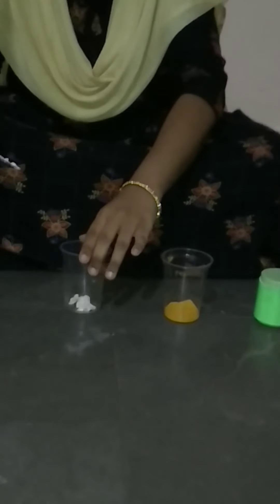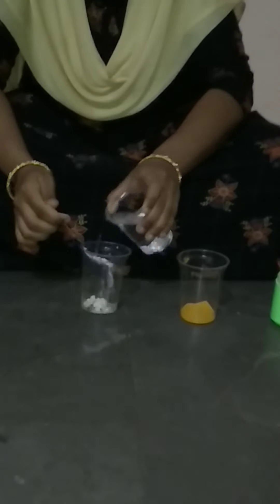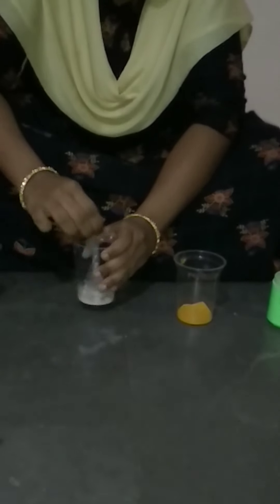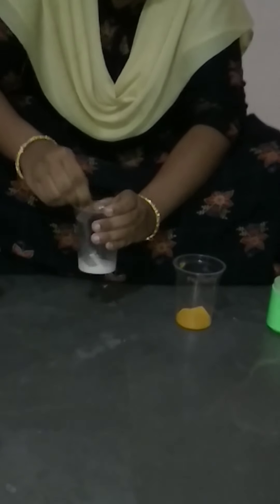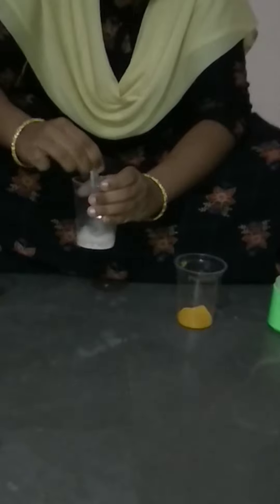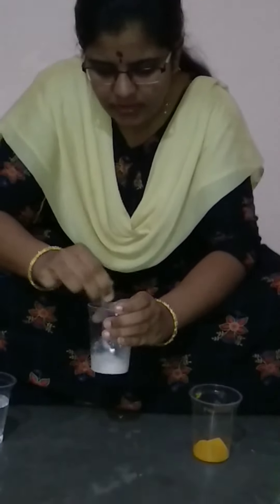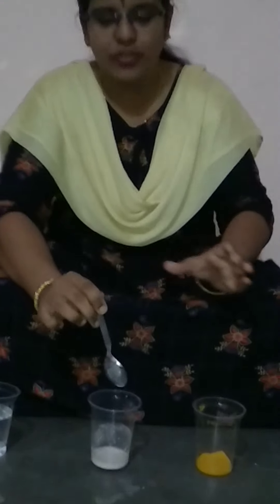Calcium hydroxide will be available in any general store, or you can get it very easily from Pooja stores as well. Let us add some water and make it into a calcium hydroxide solution. The solution has formed — a white color solution.